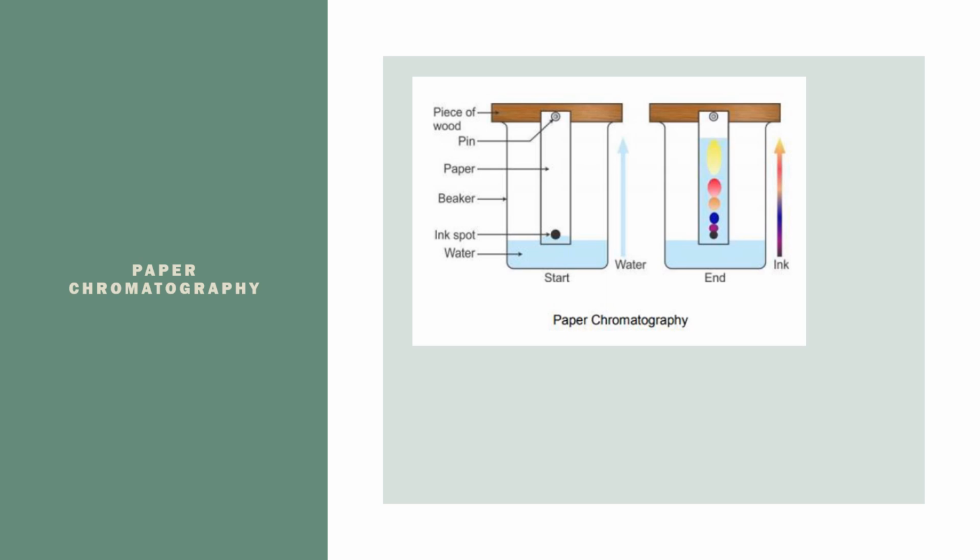Essentially, you're going to start with water or some kind of solvent, but it's typically water. And you'll have a mixture on a piece of paper. You put the paper into the water, and the water will start to move up the paper. It does this using intermolecular forces. And as the water is drawn up the paper, when it encounters the mixture, the mixture gets drawn up with the water.